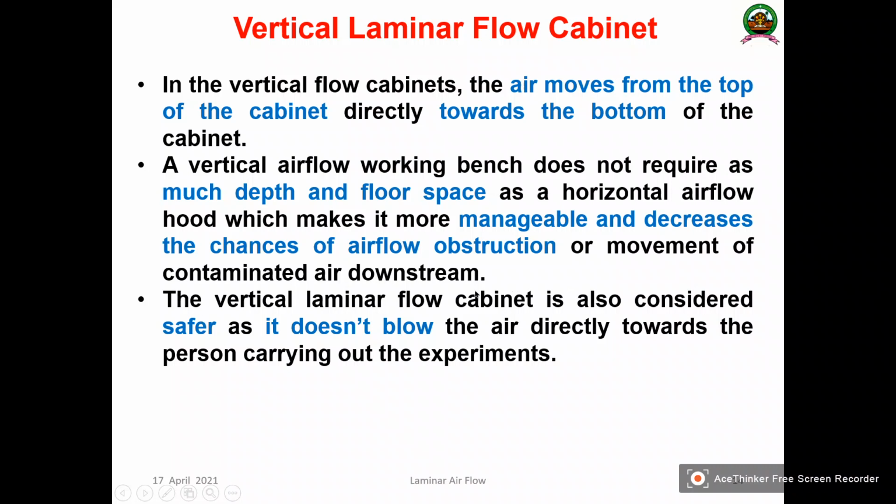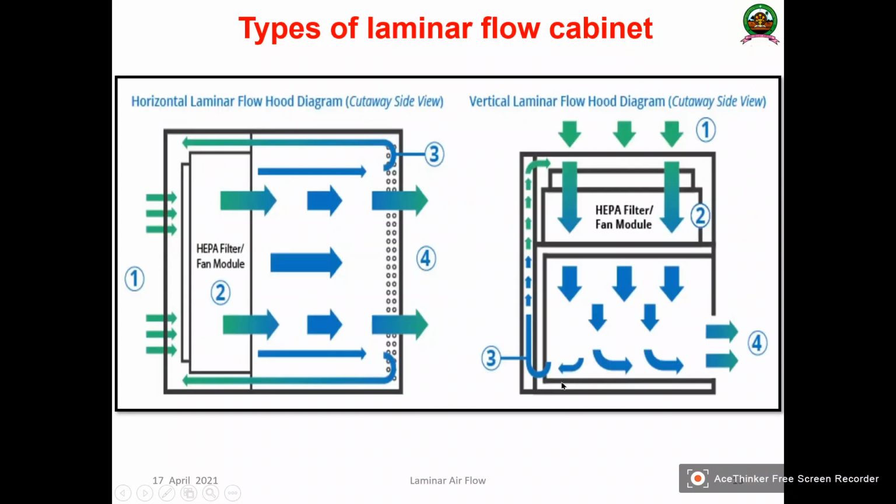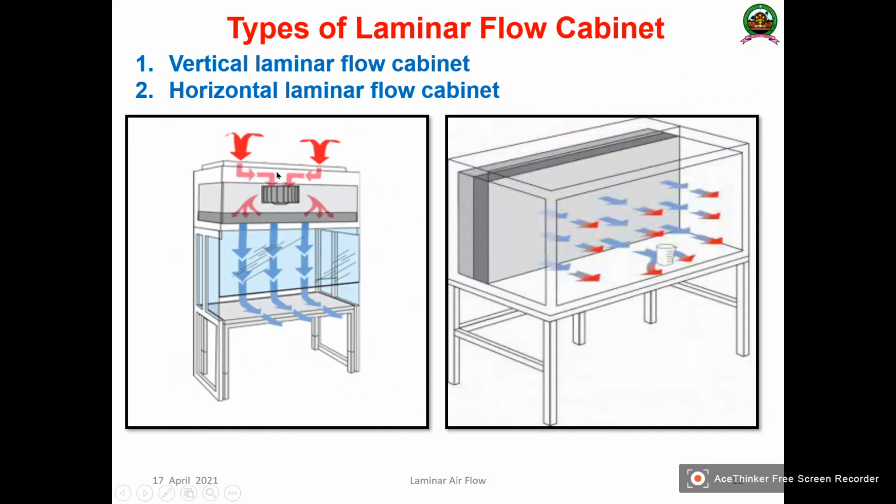The vertical laminar airflow cabinet is also considered safer, and it doesn't blow the air directly towards the person carrying out the experiment, because the airflow is from top to bottom, and it requires less space, and this is very safe to use.